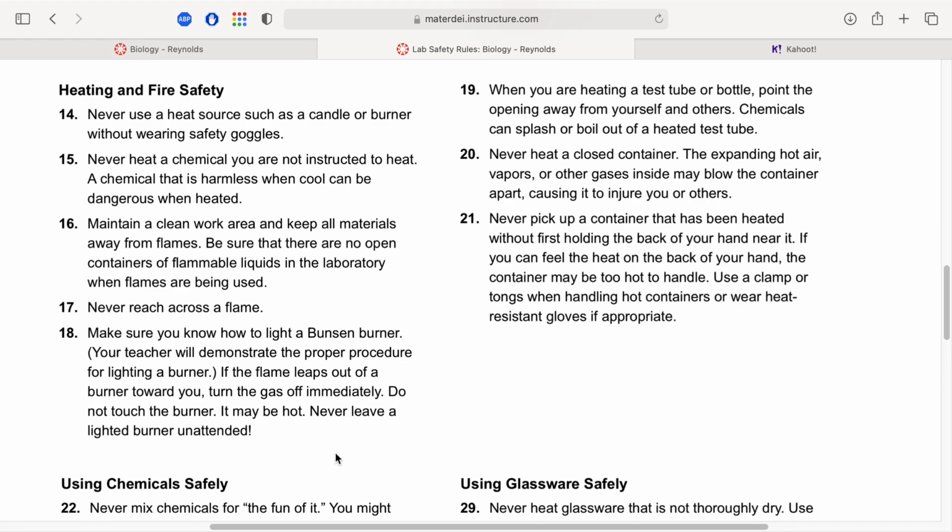All science classes are pretty similar. On this first floor, it's all life science. Upstairs, it's chemistry and physics. They do a lot more with flames. Every classroom has a shower in the corner, an emergency shower that you'd pull the handle for, or an eye wash station. It's turned off. There are no drains on the floor. If we need water, it's in the sinks. Between every lab table, there are sinks where you could splash water on your face, and we'll send you to the nurse.